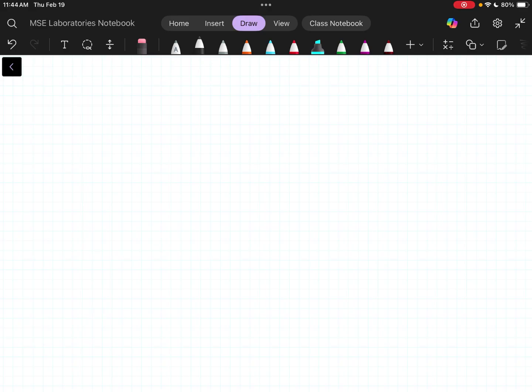Any questions? Good. Line up with your chemistry stuff you've done? Yeah, organic chemistry. Okay. Let's talk a little bit about how the instrument works, because I think it's interesting, and so we're going to talk about it. And I'm going to use red because infrared, and so red is just the color. Oh, wait, actually, no. I'm going to use purple because I split the color in a second.